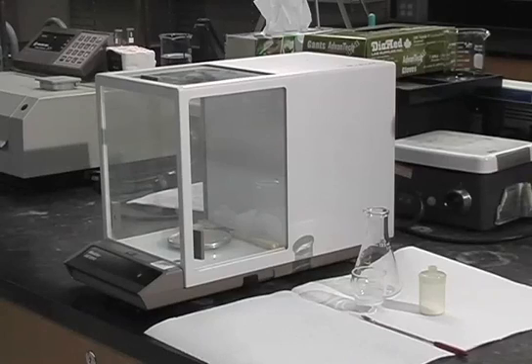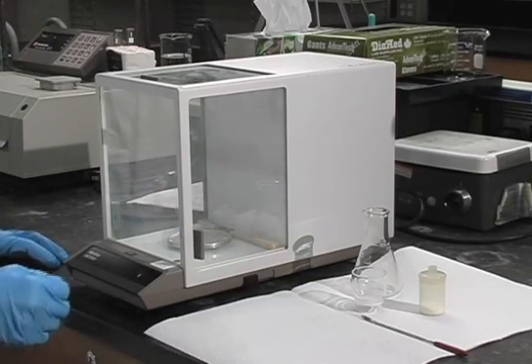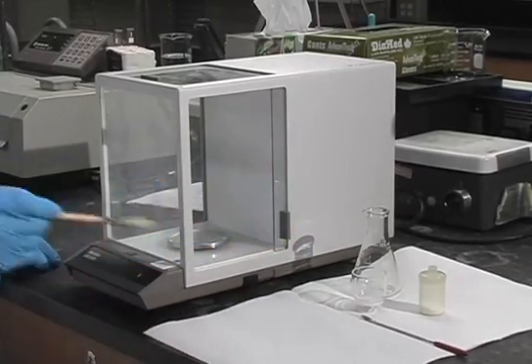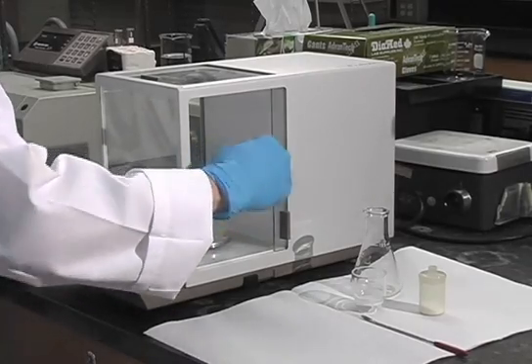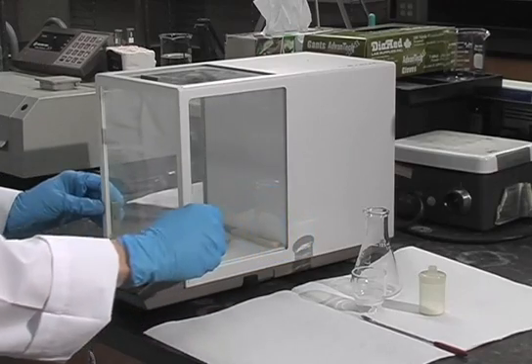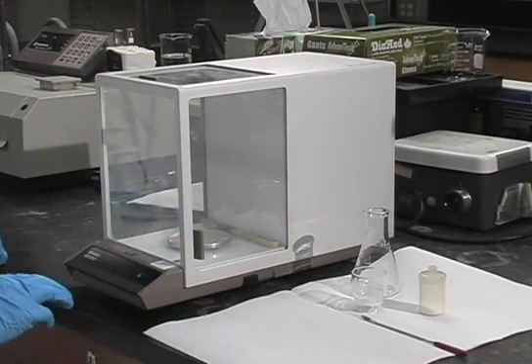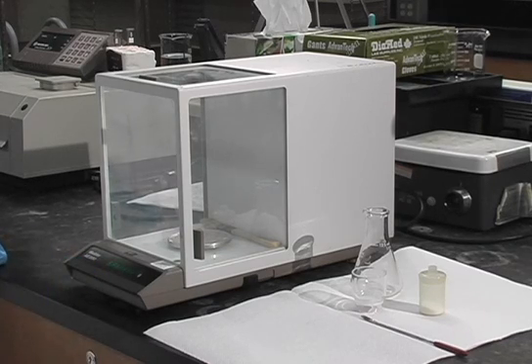This is the analytical balance. A general precaution for its use is to first ensure that the weighing pan is clean, so just give it a little brush. Make sure that all the doors are closed before you turn it on. To do that, you just press the control bar. It just takes a few seconds to warm up.